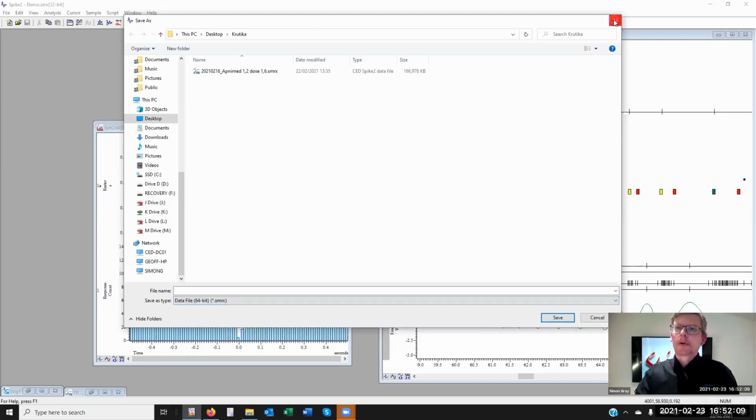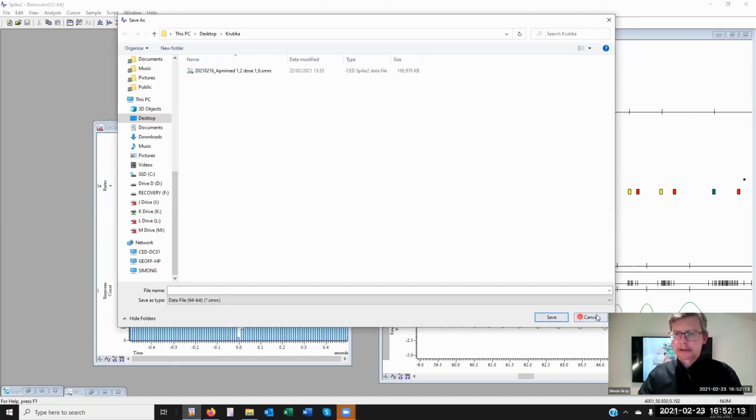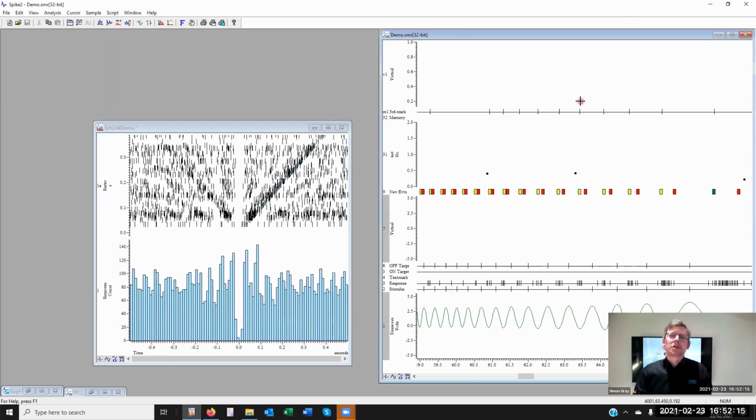However, everybody's different. Everybody needs something slightly different. And so we could look at this output using a script to give you more information. Many people just recently have been asking about raster data. So I've written scripts to produce something a little like this, to dump the list of times relative to 0 for a section of the data file.